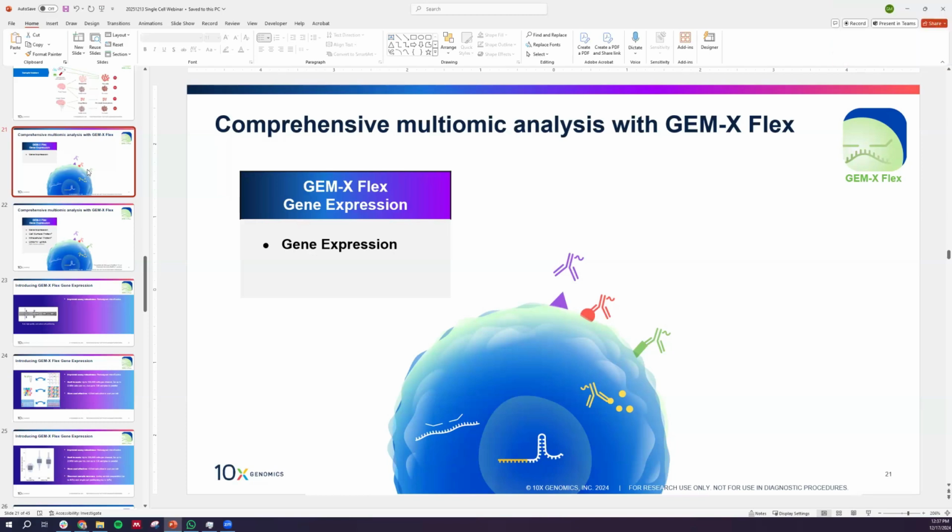So it's just for mouse and human at the minute, I'm guessing. It is for just mouse and human. It has been expanded to other species. Typically, those species have high homology with either mouse or human. You can spike in custom probes. We've got guidance on how to design your own probes to spike in, but that's generally for detecting species alongside mouse or human transcripts, like viral transcripts or bacterial transcripts. Expanding to plants, for instance, would require synthesis of a whole new custom probe set. So certainly feasible, but something that it has not quite.